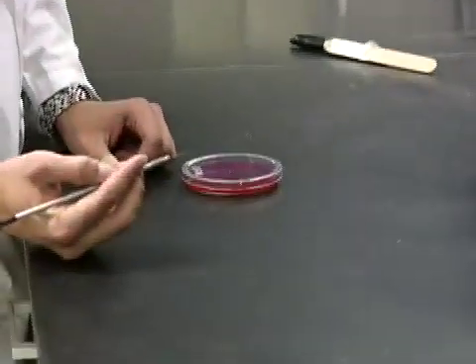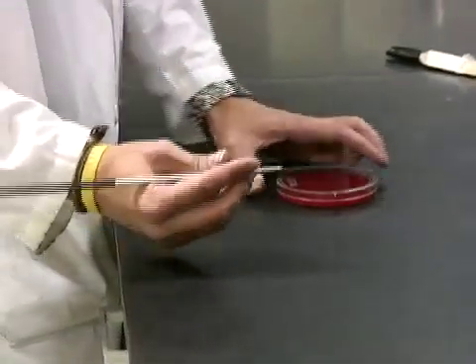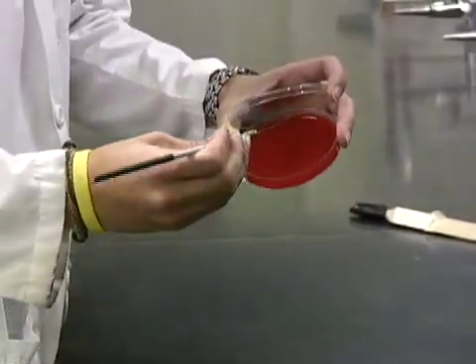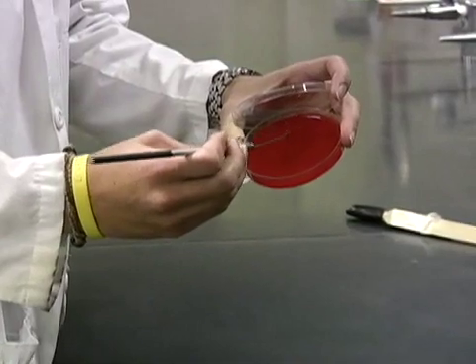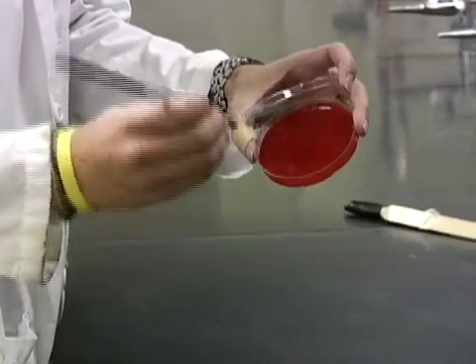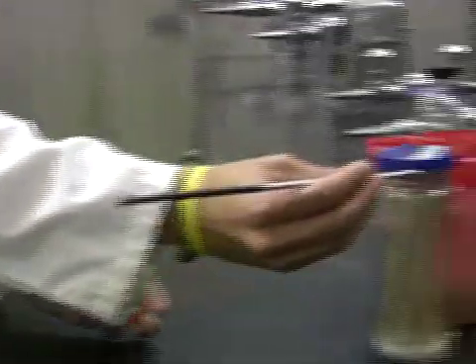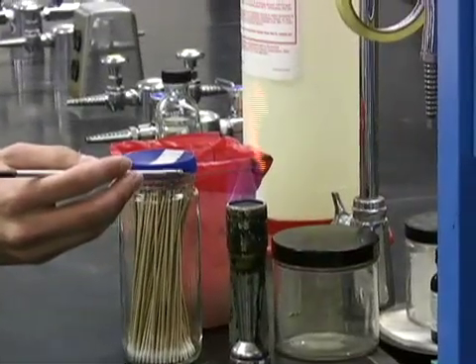Streak the remaining two quadrants using your inoculating loop. As seen in the procedure for streaking on BAP, you want to stab an unstreaked portion of your plate before flaming your loop. You only need to do this once.